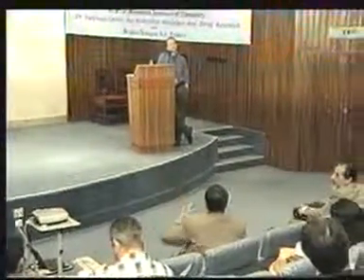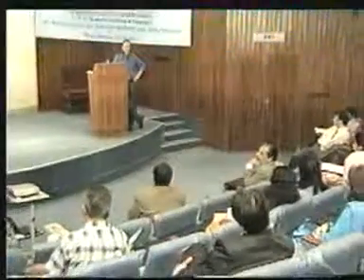The Dewar is about the same price. The technology that we use is about the same. The price of the material is much higher. And this is really the difference of price between 500 and 600, and between 700 and 600; it comes from the magnet. The reason why we didn't go for a higher field NMR, although we had an option of going to 800 and even 900, is precisely the same. We decided to buy 600 with cryoprobe, which is much better than going to 700 and 800 with a normal probe. This is true. So that was an advantage.